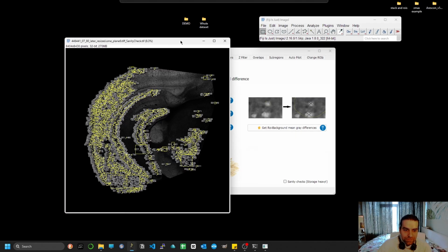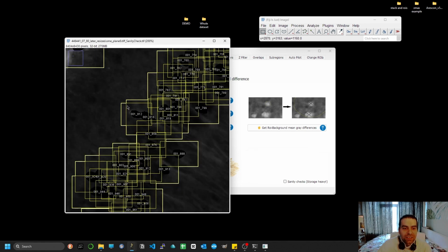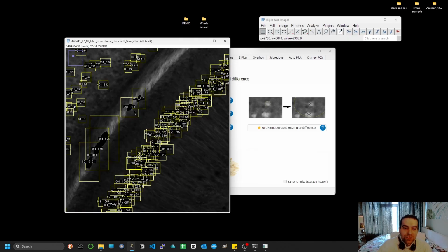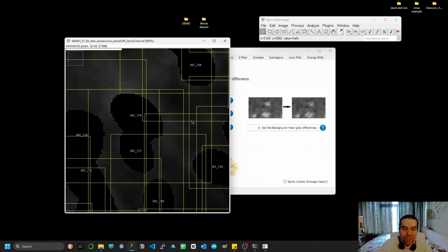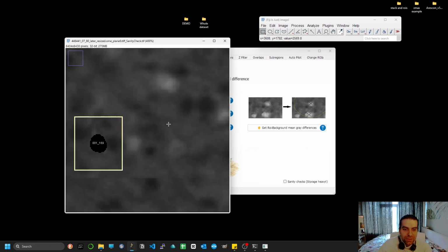Alright, I have also overlaid the regions of interest here with their bounding boxes, so you know what was actually counted. So let's try to focus. I know it's not easy. Let's try to find something less noisy maybe.